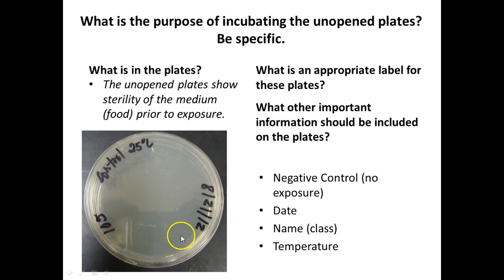I'm horrible with section numbers, so unlike in the past, I just wrote Wednesday because we're the only Wednesday lab. Or had you guys write Wednesday. Thank you. And as you can see, we write along the edge and the bottom of the plate so we can clearly see what's on the plate. It's okay if you didn't write on the edge, right? But from now on, it's good practice to write along the edge of the plate. Helps in the visualization of what's on the plate.